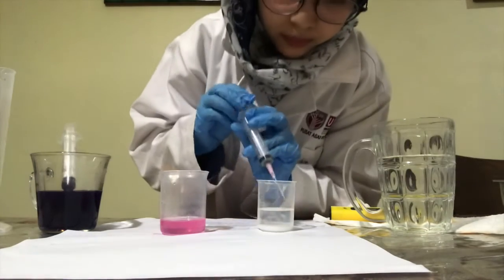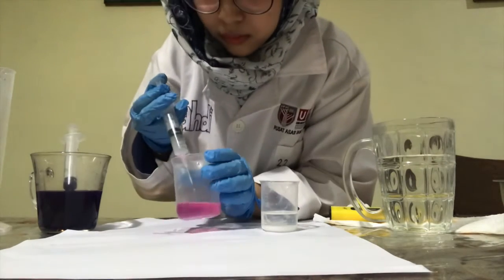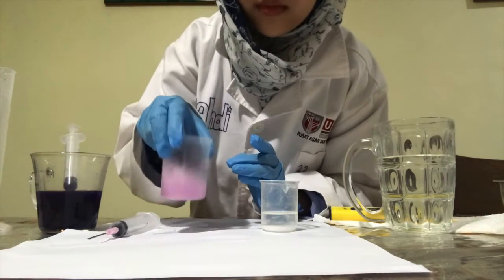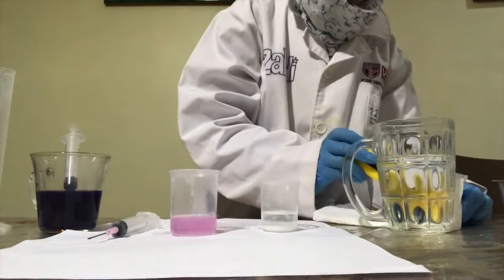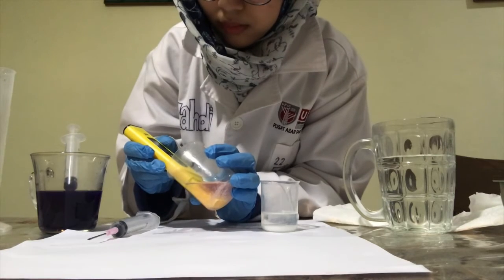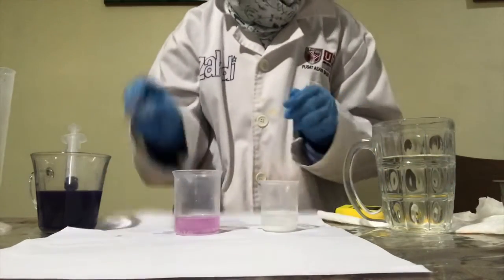Using a syringe as a burette, add in 5 ml of the titrant into the analyte each time, and also check the color of the analyte with pH indicator and also measure its pH with pH meter. Record the pH measured every time 5 ml was added.